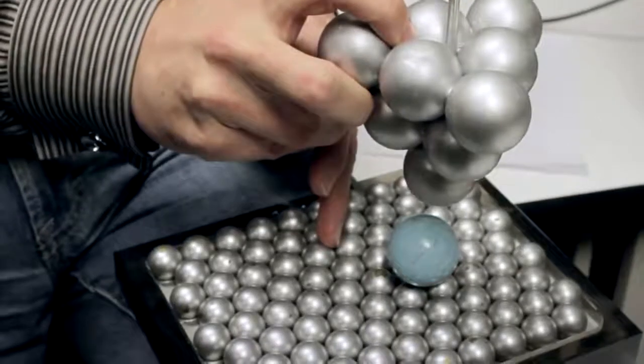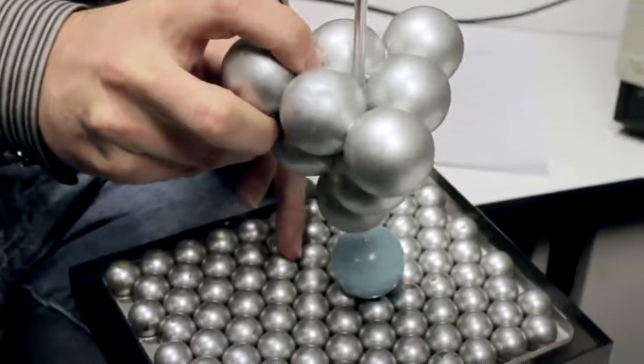So we start to form a bond such that the atom follows the tip around on the surface. And we can drag it to a new spot. When we withdraw the tip, it holds still because the surface is holding it in place. And we can take an image and see where we've placed this atom.